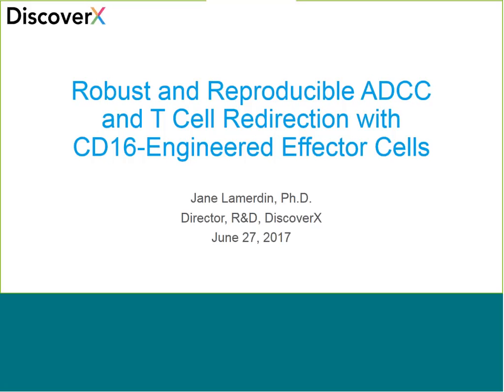As you're all aware, PBMC effector cells used for cytotoxicity applications like ADCC have inherent donor variability, thereby reducing their consistency and reproducibility in lot release assays for biologic drugs. Also, ADCC, or Antibody-Dependent Cell Cytotoxicity assays, that measure cell death often have low signal-to-background ratios and suffer from this donor variability of the PBMCs.